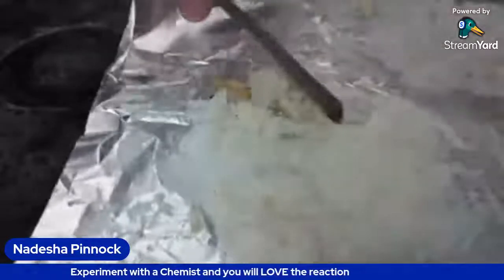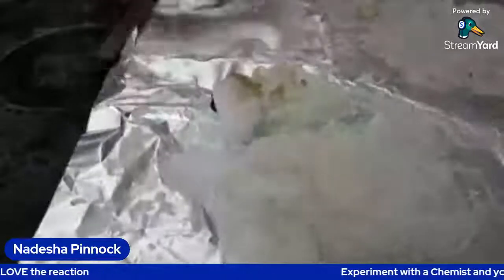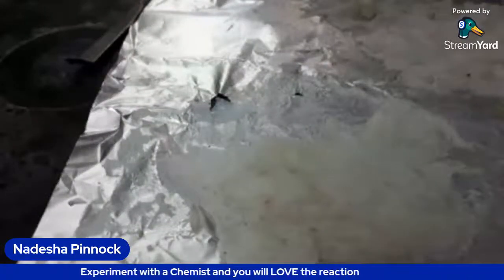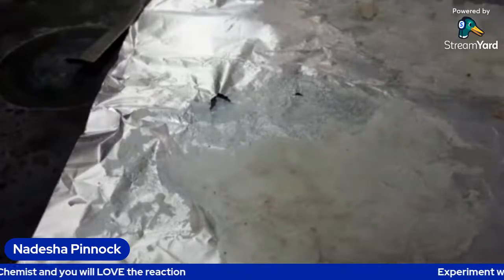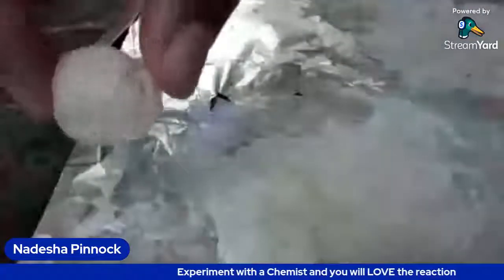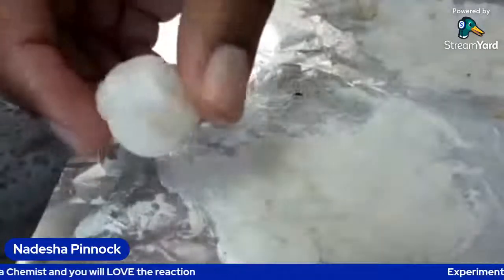After you heat it, you see that it appears less and less opaque. I think it will harden more after it cools, because it's hot right now. So I roll it into a ball.